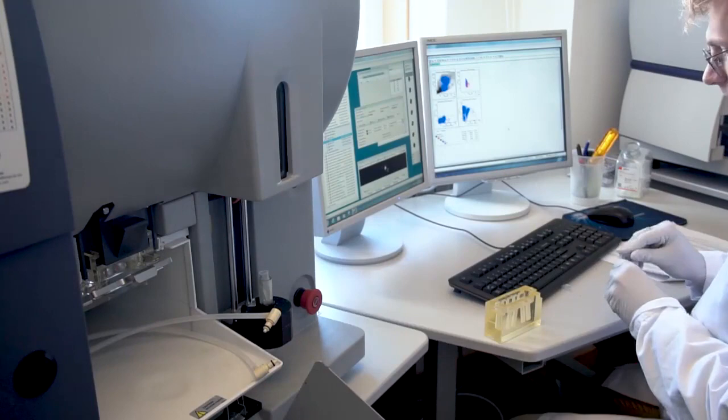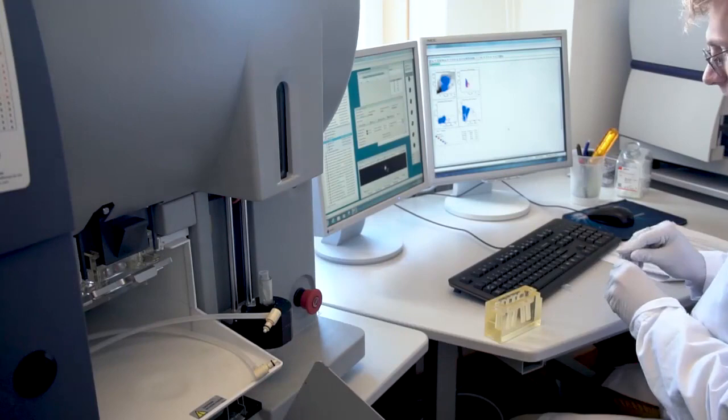Once the FACS machine has been properly set up, perform reanalysis of the target population by sorting at least 100 target cells into a new microcentrifuge tube.